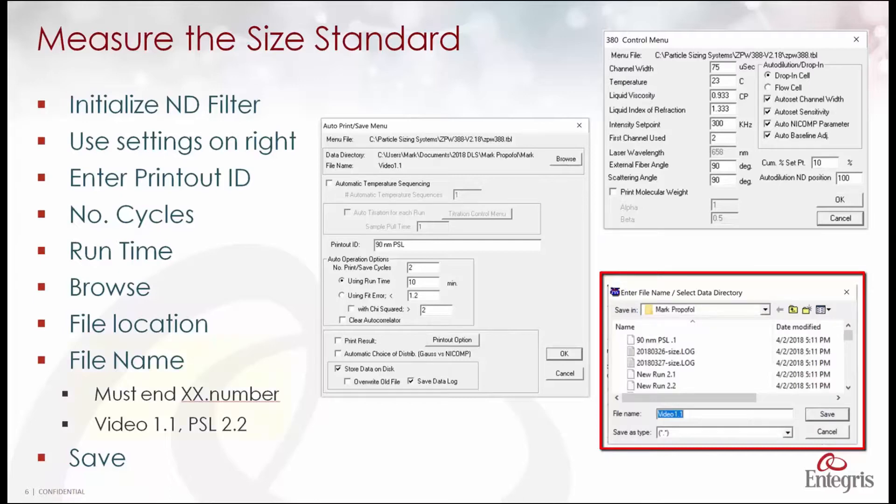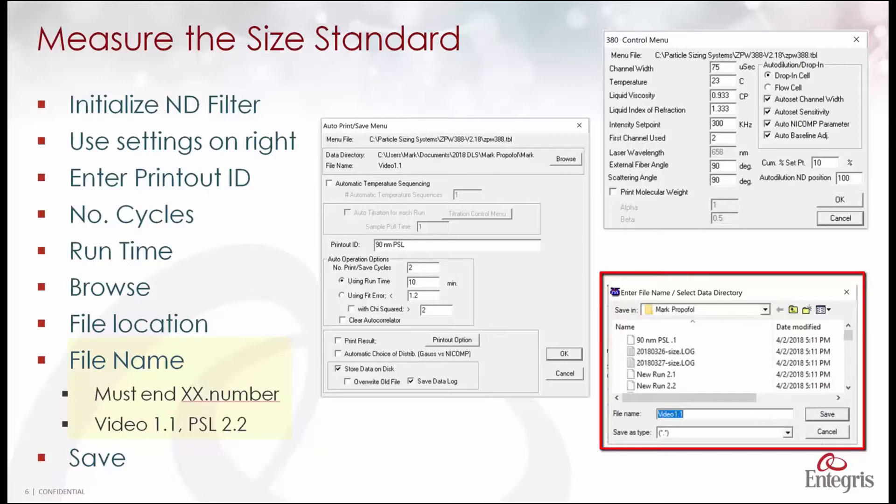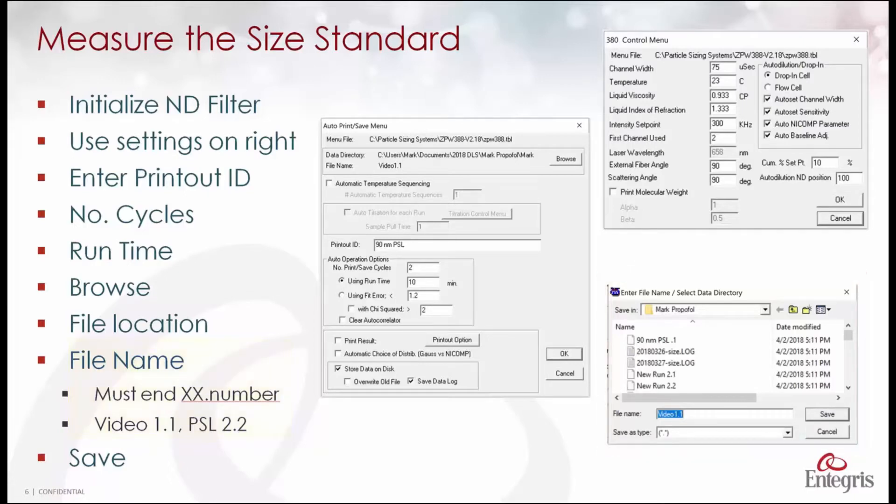A funny thing about this software is that file name must end with a name period and a number such as you see here video 1.1 or PSL 2.2. Click save and then we are ready to make a measurement as we will see in the next screen.